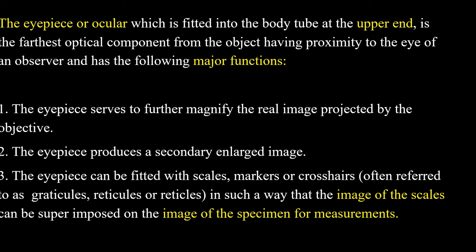Third function, the eyepiece can be fitted with scales, markers, or crosshairs, often referred to as graticules, reticules, or reticles, in such a way that the image of the scales can be superimposed on the image of the specimen for the measurement of the particular specimen.